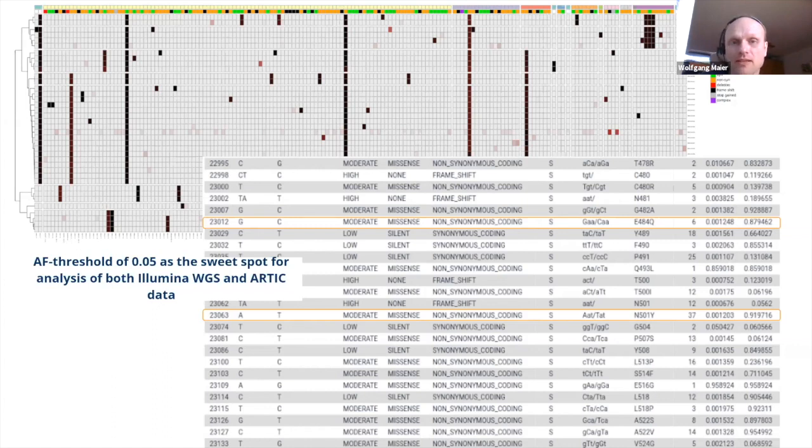You can actually also see the other key position, the one from the South African and Brazilian variants, E484K. And you can see that, overall, these were over 1,800 samples analyzed together in this report. It's totally absent from the British data, but there are actually 6 samples for which an E484Q, a much more conservative mutation, is picked up.